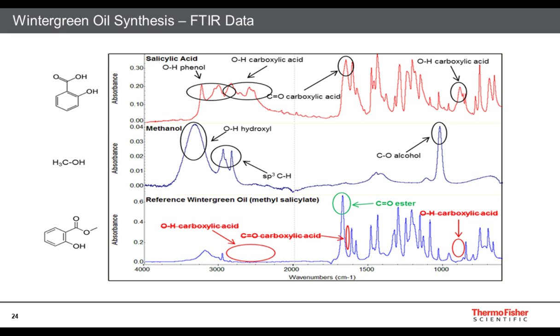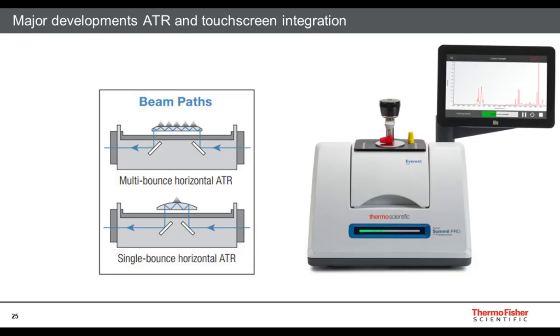Similarly, wintergreen oil gives a very pleasant odor in the laboratory. You start with salicylic acid, that same starting material, but in this case react it with methanol. So we've got that very distinctive, broad, strong hydroxyl stretch out at the 3300, and with the formation again of the wintergreen, the methyl salicylate, that hydroxyl group is gone, and so we lose that big broad stretch, and we also lose the carboxylic acids as well in favor of the ester. So the analysis of the two is very similar.